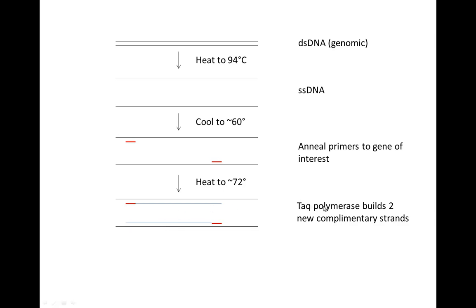Now, this is what makes Taq polymerase so special, because the next step, you heat it up to 94 degrees again. Ordinarily, that would kill an ordinary polymerase. It would kill our polymerase. It would completely denature it, and so to go to the next round, we would have to add more of that polymerase. So each one of those 34 rounds of PCR that get done, you have to stop and add more polymerase. That's not particularly functional. It takes an extraordinarily large amount of time. It changes the volumes involved. It changes the concentration of your buffers. It gets very, very complicated.